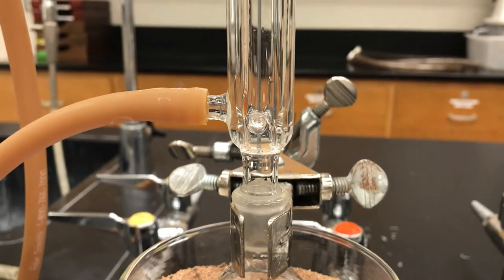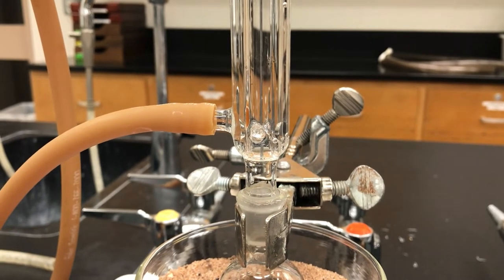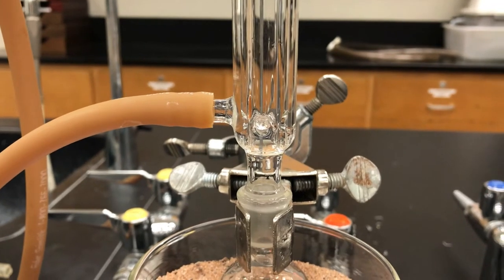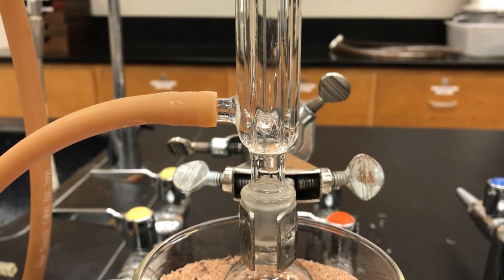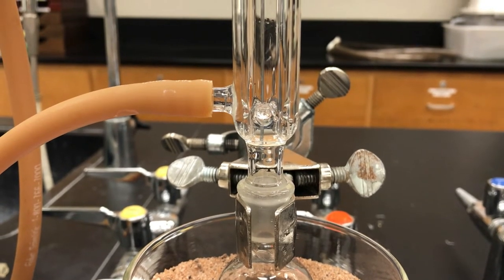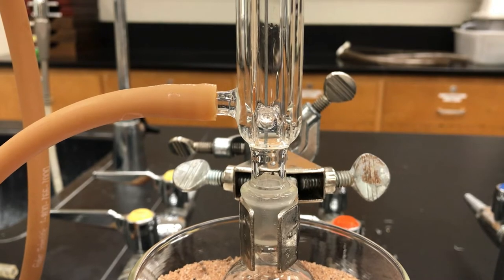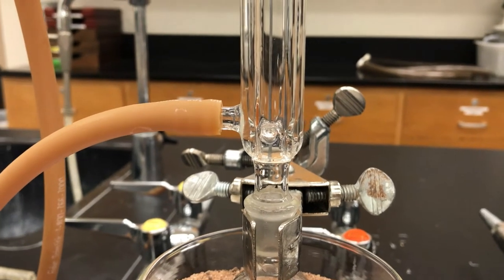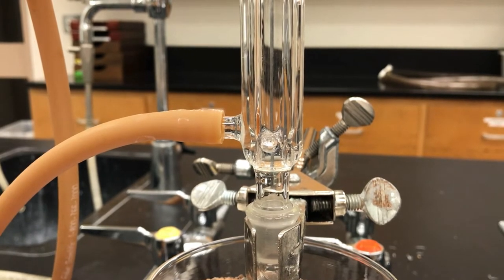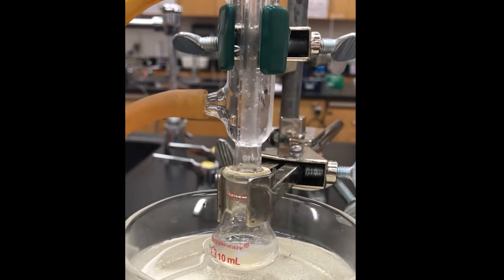So the liquid is boiling and hitting that cool surface, and then condensing and dripping back down into the original flask. So it is actually quite difficult in the video to see that anything is happening at all. Certain solvents don't make real, obvious, visible droplets, and it's something that in person, if you look really closely with your eyes, you can see some movement in the condenser, but it's not always incredibly obvious that it is actively refluxing. Here we have a much better, much more obvious example.